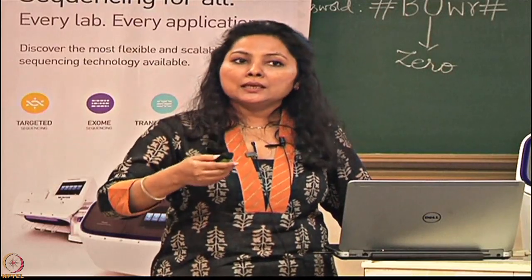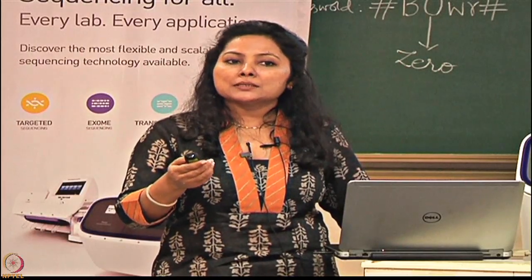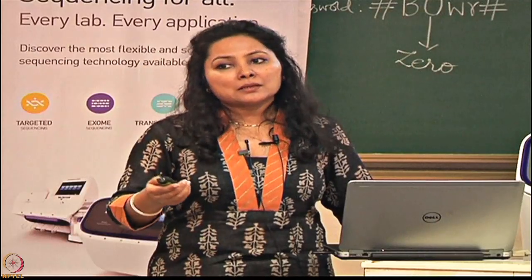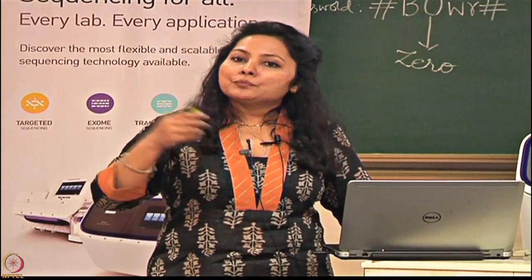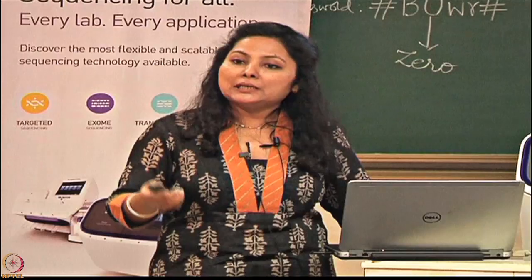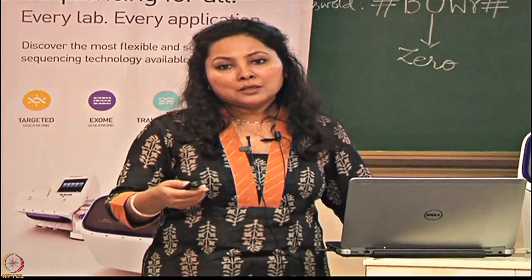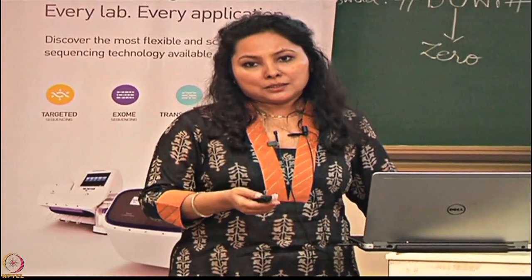Now suddenly with massively parallel sequencing, you can imagine what is happening is you have millions of wells, and you have this sequencing happening in all those millions of wells, and that is how you are generating a lot of data per run. So that is massively parallel sequencing.